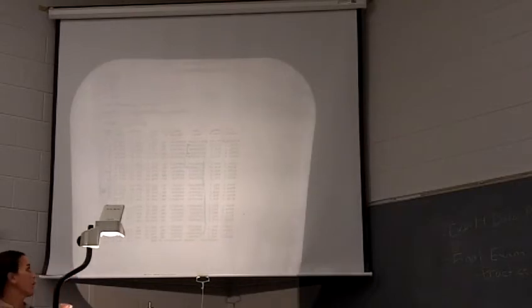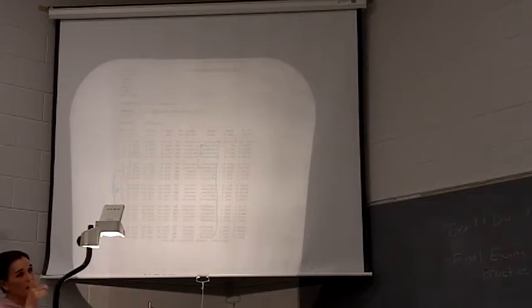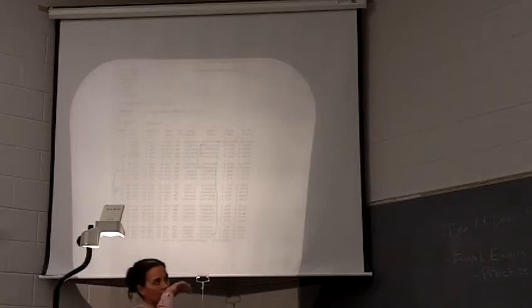Here is the data for a data set that was run under conditions A from last week, an example of what conditions A would have been. So that would have been using 1-bromopropane at 0 degrees, all right? And so I'm going to go through what you need to put together for all of your tables, an example for each of those, okay? And we'll use this data for the example.